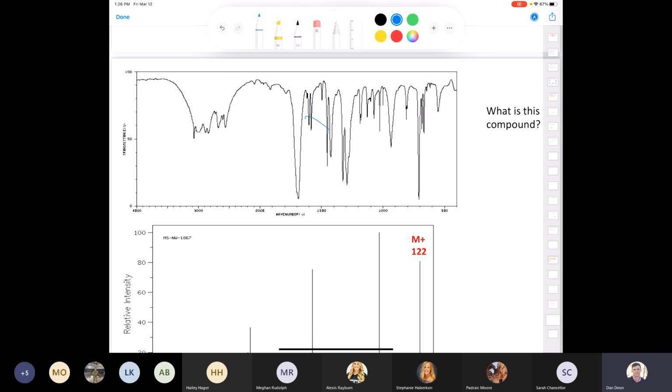It looks to me like we have some aromatic carbon-carbon stretching right here, doesn't it? Between 1475 and 1600? Yeah, I'd say that. Also, Josh said there's a carbonyl stretch here. Yeah, absolutely. I know that this range of signals here might not be as big and broad as some of the oxygen-hydrogen stretches that we've seen, but this is an oxygen-hydrogen stretch right here.